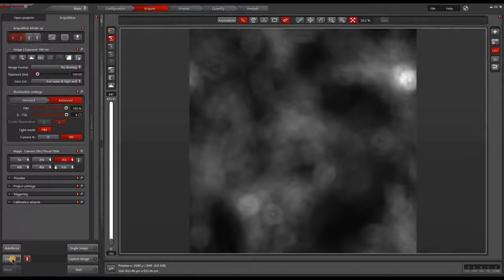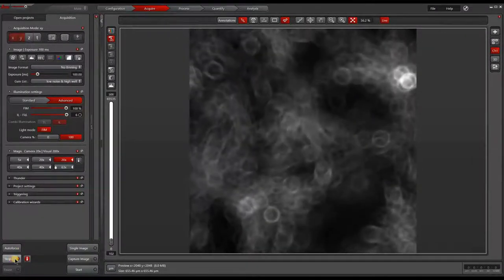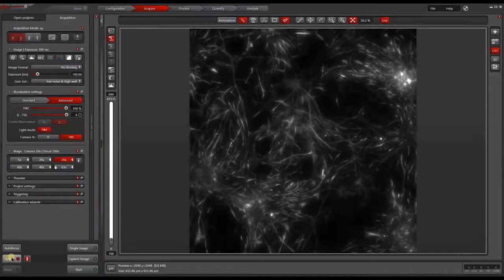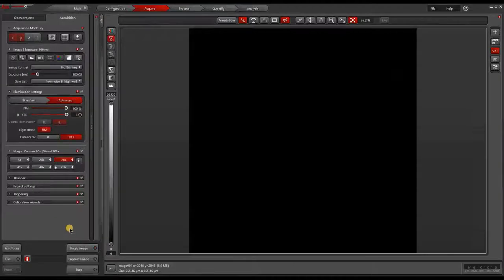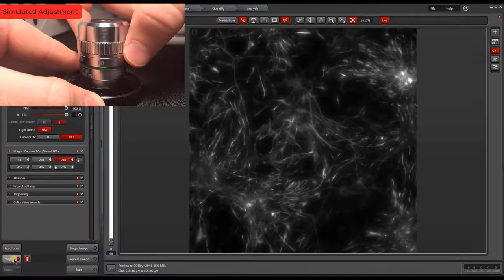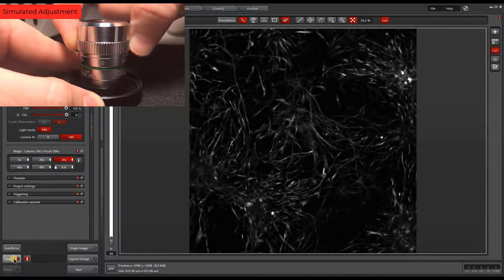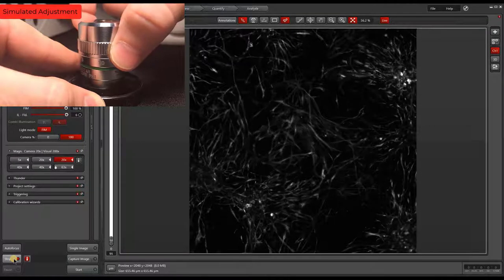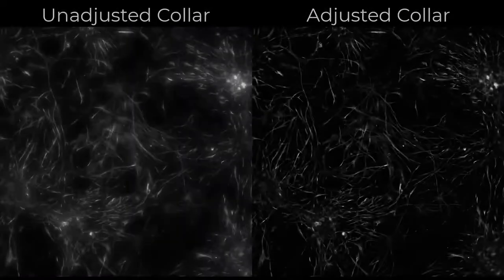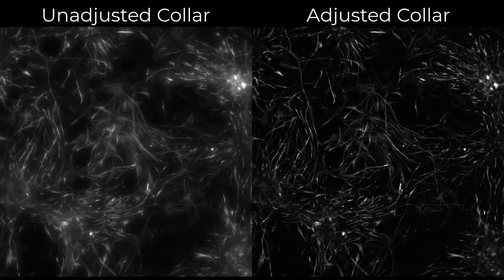With the objective in place, we will focus onto our sample. Once in focus, we'll take an image to compare to once the collar has been adjusted. We'll now start adjusting the correction collar while looking at the live image. The inset shows the adjustment being made in real time. With the live image, we can find the best position for the collar. We can then capture a final image and put the two images side by side to see the improvement the adjustment gives us.